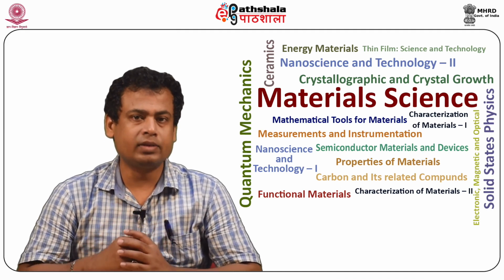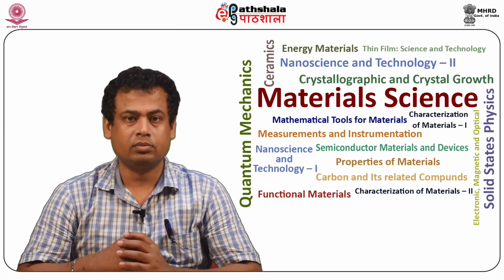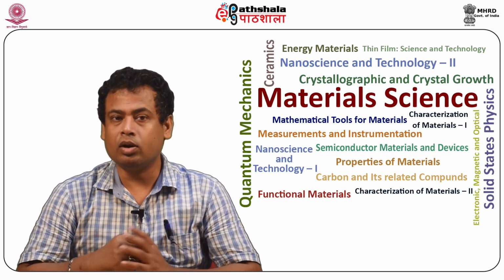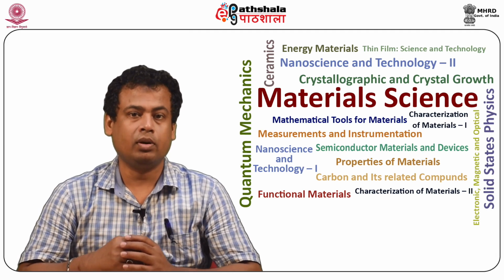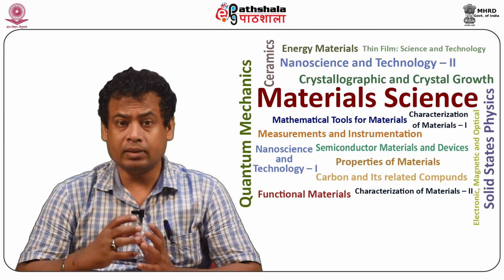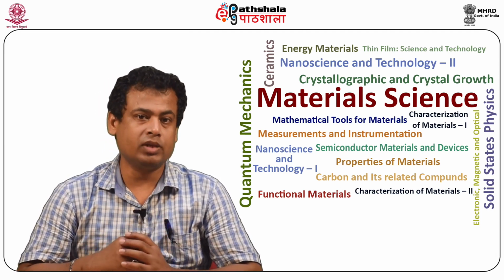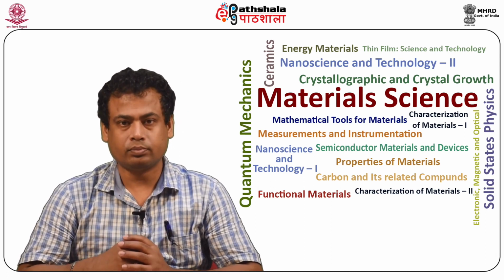These bombarding electrons, also referred to as primary electrons, dislodge electrons from the specimen itself, known as secondary electrons, which are attracted and collected by a positively biased grid or detector.